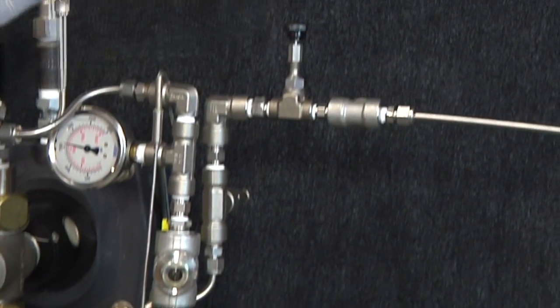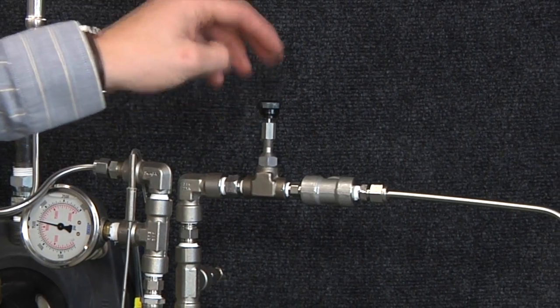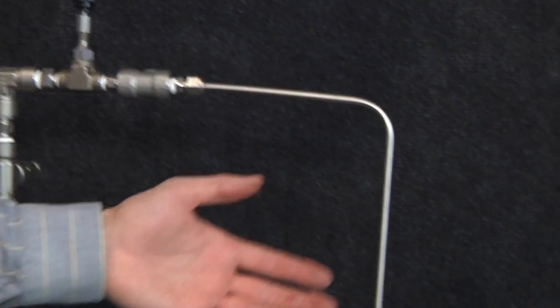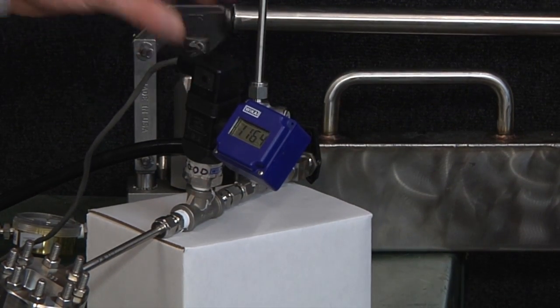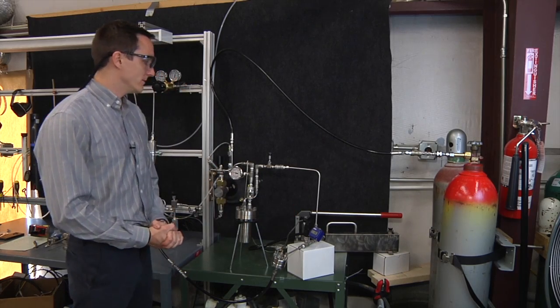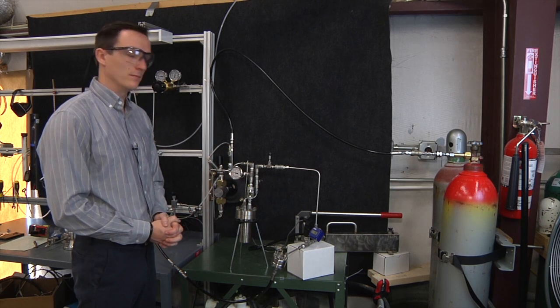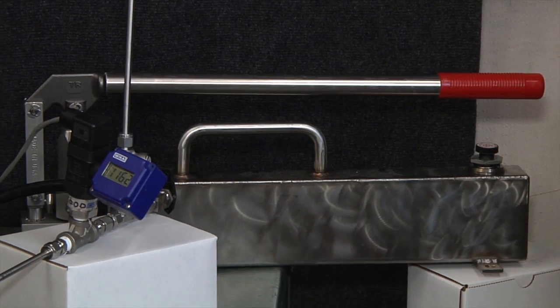From the vessel, we go to our flow controller valve, which leads to the Wacup pressure transducer. This Wacup pressure transducer monitors the inlet pressure of the back pressure regulator, and also, we have a junction here where we have a high-pressure water pump that will be pumping water through this regulator.